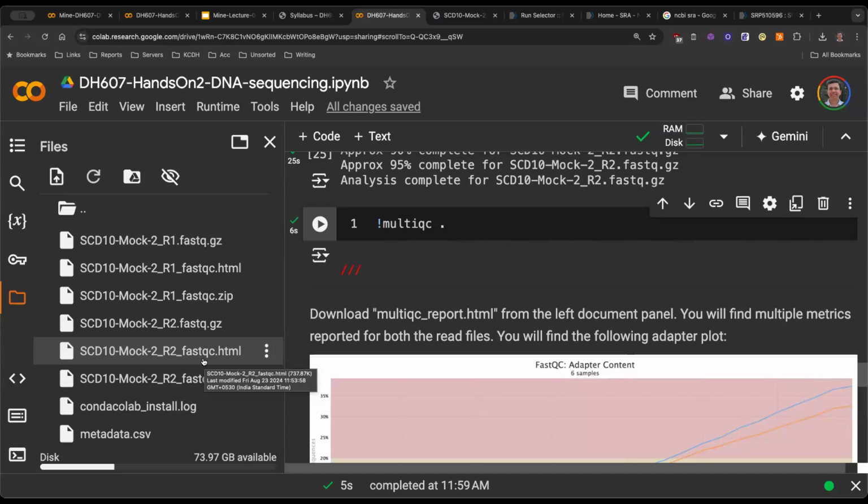So what happens is this is what your flow cell begins with. It will do a bend. It will bend over, make multiple copies of it. It will create a bridge, and then you will fold it back. This is amplified reads. This is PCR on the spot. Okay? That's the innovation that I was focusing so much on, that I almost got emotional. Like, how do you figure this out? So this is that innovation.